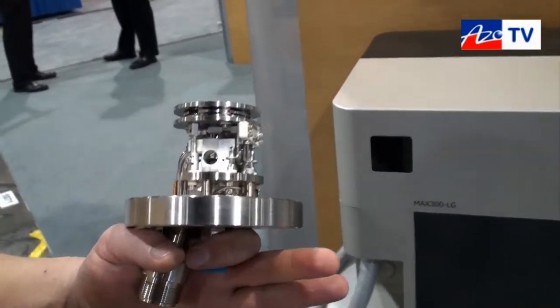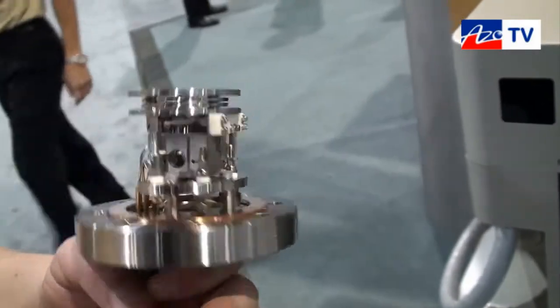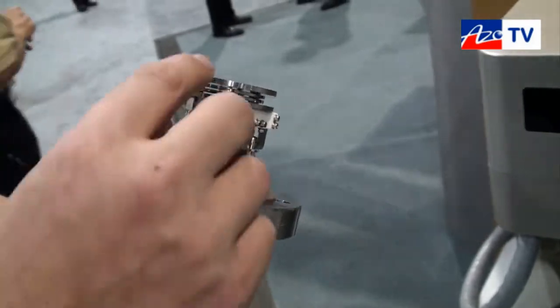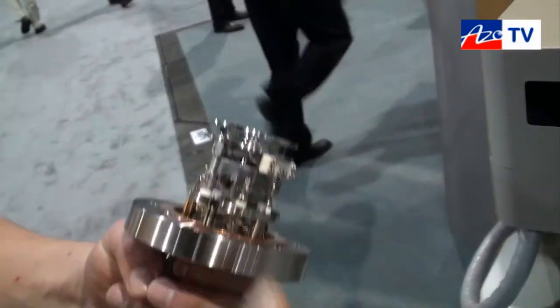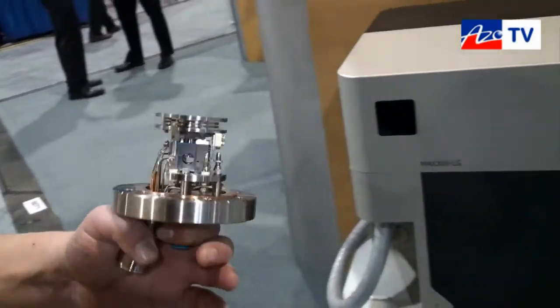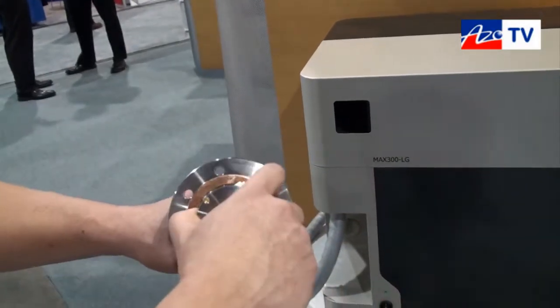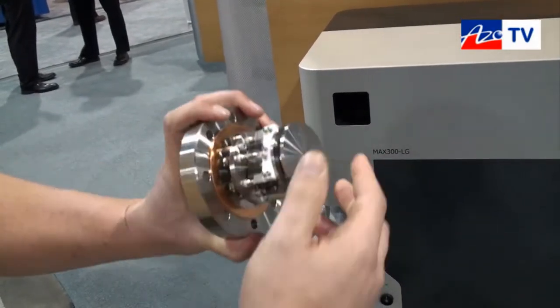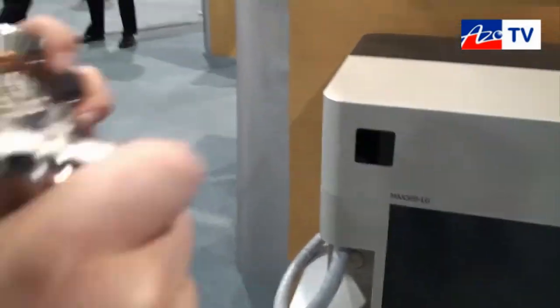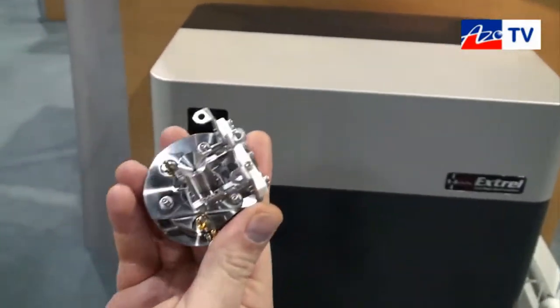Here we have our Max 300 ionizer assembly. A really nice feature of the Max 300 ionizer assembly is the use of the disposable filament or lens stack and filament assembly. We understand that the TGA application can be a dirty application, so one of the things we focus on is easing maintenance for users. This piece is connected by three banana clips, simply pops right off, and is manufactured to be completely disposable.